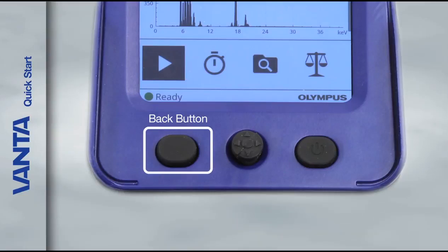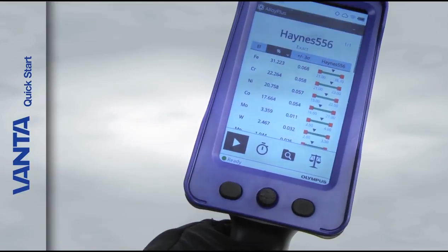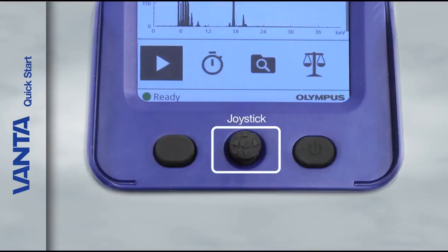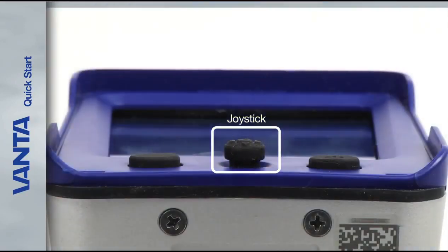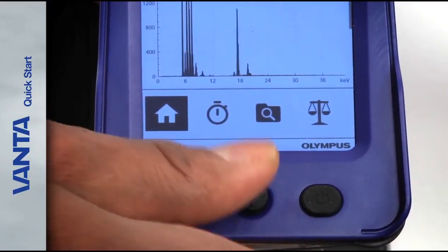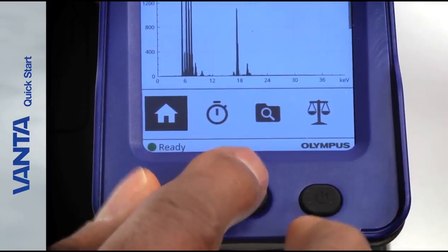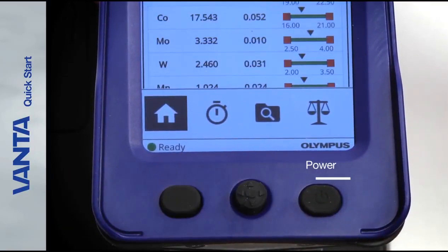The leftmost button is the back button. Press this to return to the previous data field in the UI. The center button is the joystick. The joystick moves in four directions: up, down, left, and right. When pressed, the joystick functions as an enter button. The power button is on the far right.